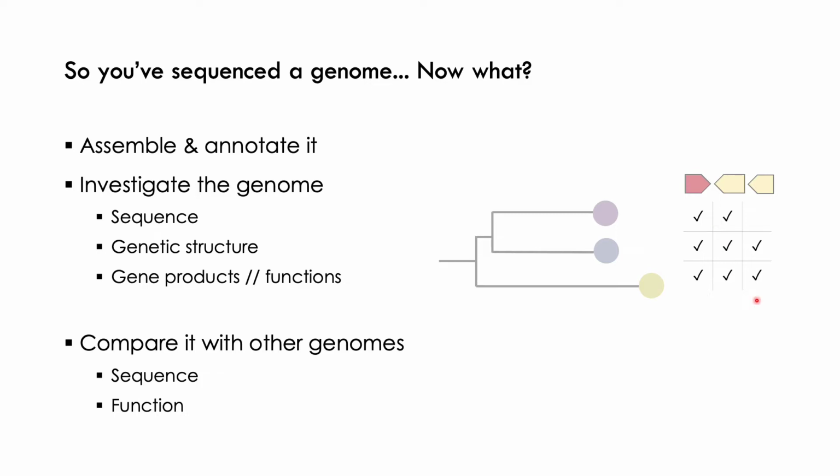You can really convey a lot of information in a single picture in a slide or a publication or something like that. So one that we've got here, for example, is a really common one where you have what's called a phylogenetic tree, and this is showing the genetic relatedness between genomes, and you can overlay onto this tree any metadata or genetic or phenotypic information, and this is going to really help you communicate what you've found in your novel genomes and how your novel genomes compare to other genomes.